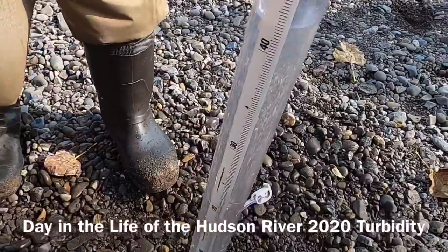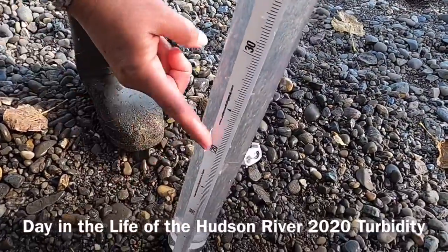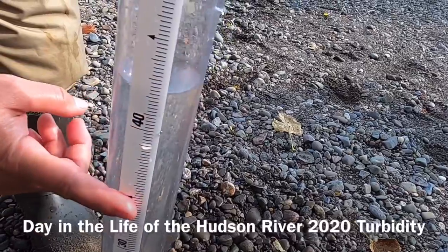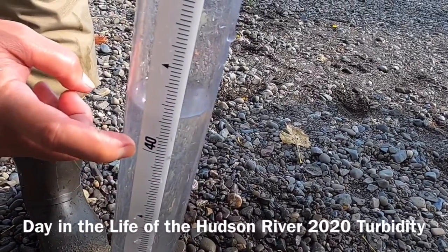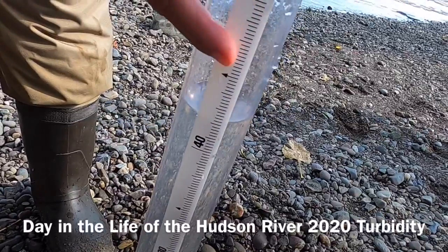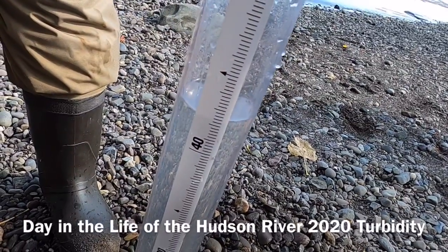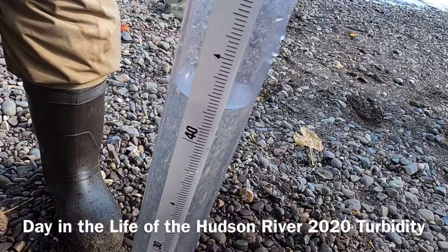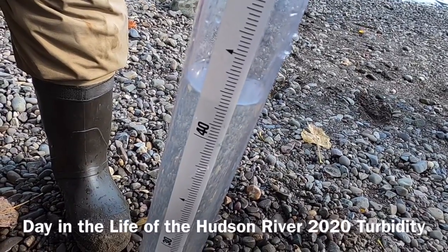So this again is in centimeters. We've got 10, 20, 30. Of course, this indicates 35, right? Here's 40. There's 45. So you can go ahead and pause the video, see if you can come up with a reading on your own, and then I'll go ahead and tell you the reading that we got.